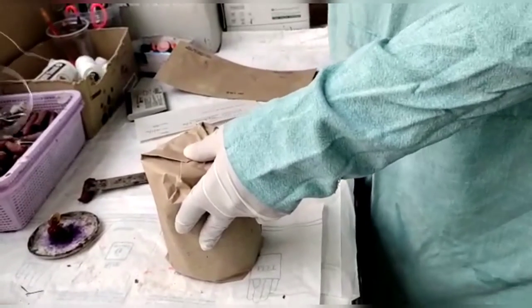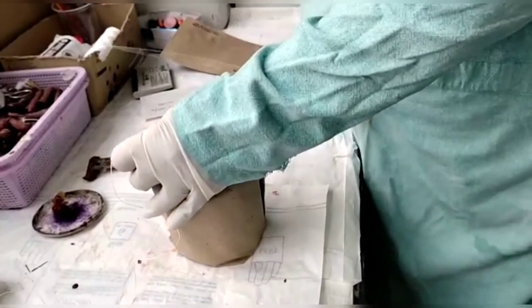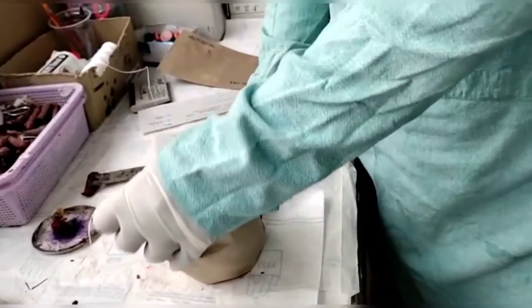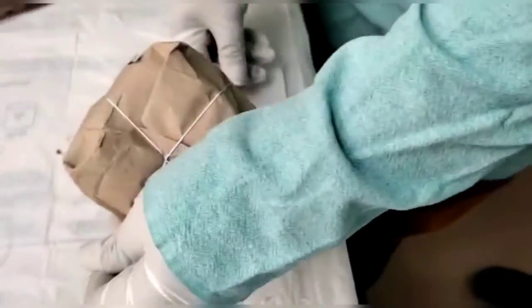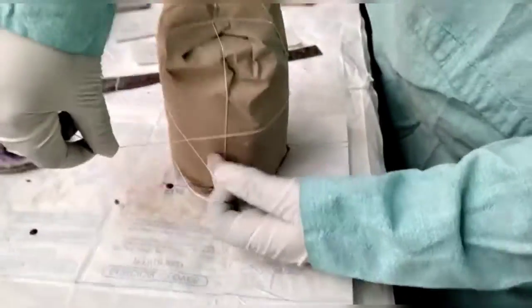Now you can see the tying of the Viscera bottle with a twine. You can carefully watch the way in which the tying of the Viscera bottle is done.